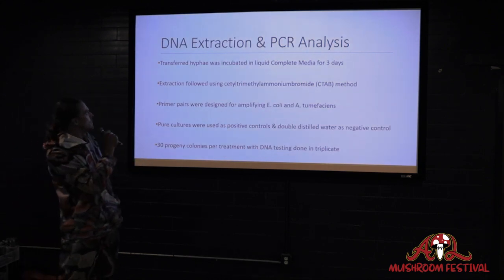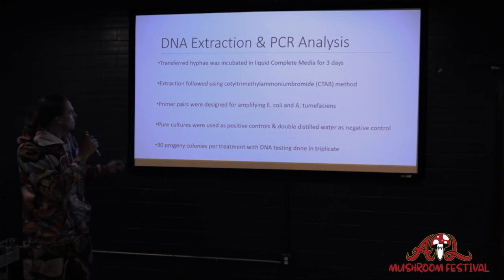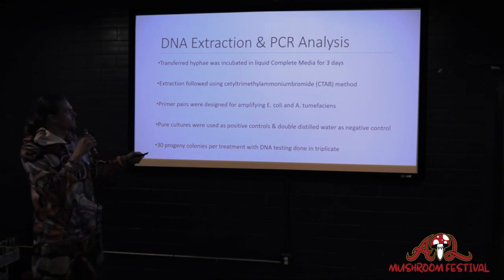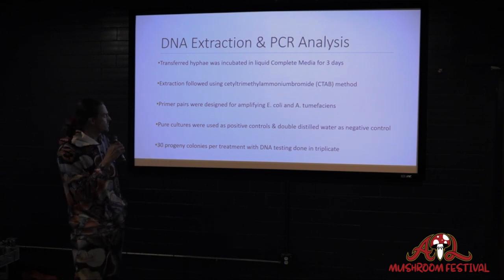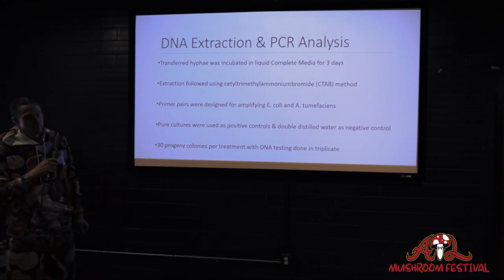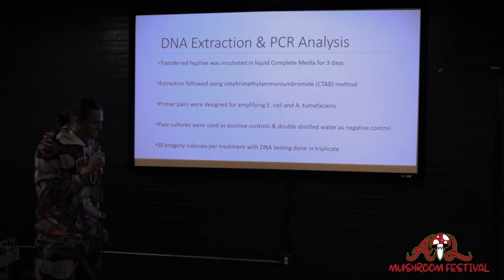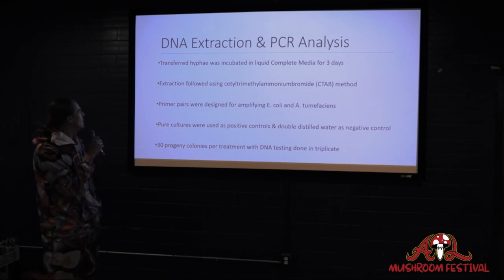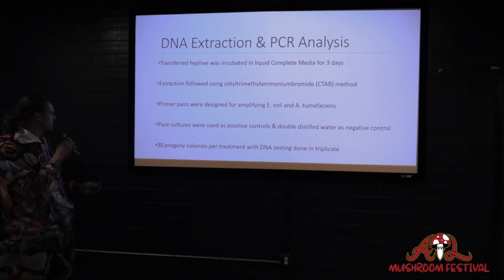Okay, so the DNA, after they let it sit in complete media for 3 days, they would do an extraction using the CTAB method, cetyl trimethyl ammonium bromide. Not important to know exactly what that is. It's just a method used for extracting DNA from fungal cultures and from bacteria, from all sorts of stuff.